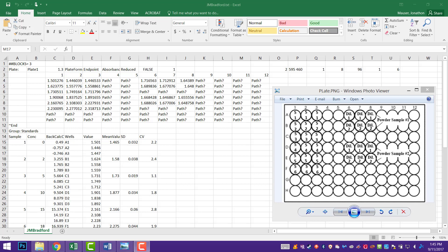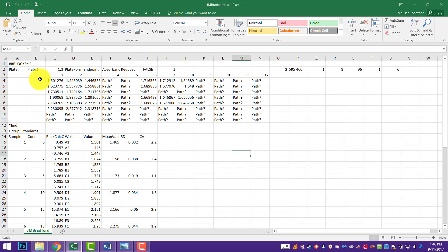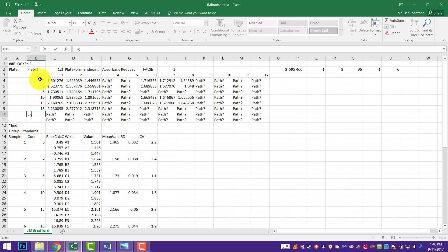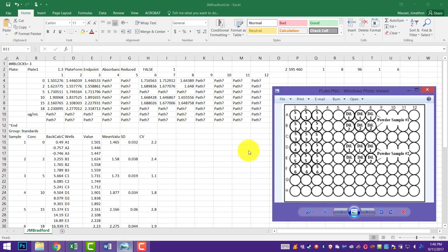Hi folks, today we're going to look at how to process data from our Bradford lab. Here I have the plate map from the protocol. We have our standards for BSA on the side. If you followed my direction, these are 0, 2, 5, 10, 15, and 18 micrograms per ml. I'm just going to clean up all this other stuff we don't need.